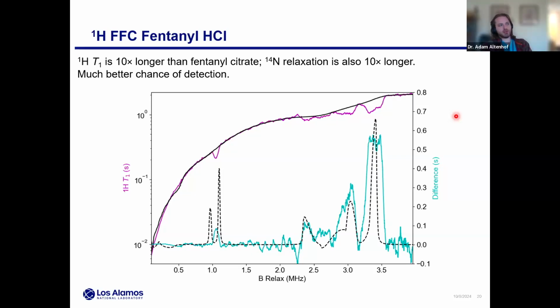If we're talking specifically about NQR and fentanyl, a lot of it's just sample dependent. I think there's not much hardware limitation. These are very simple spectrometers, very inexpensive. If you have the right sample, you can get that acquisition in reasonable time.